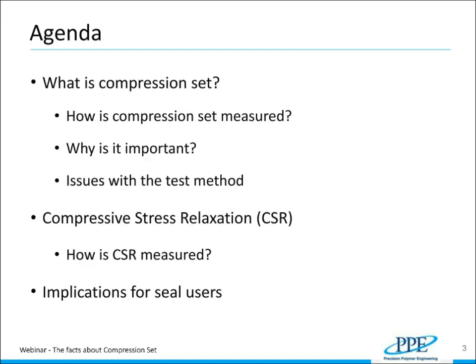So I'll just take you through the agenda for today, what we're going to cover over the next, well, I'm aiming to speak for about half an hour to give plenty of time for questions at the end. So we're first going to look at what exactly is compression set. How do we measure it? Why is it important? We'll then move on to address some of the potential issues and pitfalls that can arise from using this method, and shall we say maybe poor application of the results.